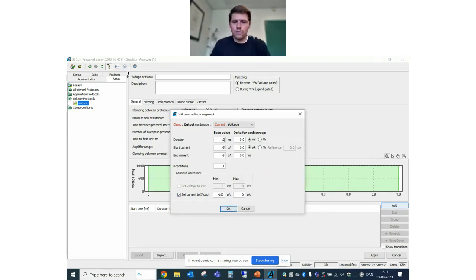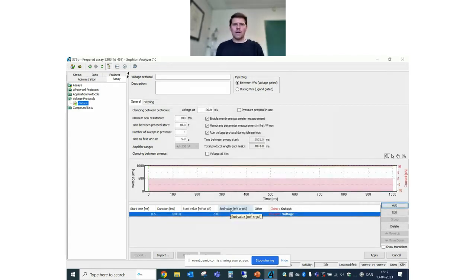And of course, you also need to give it a duration. There we go. And then you see this purple interval here is the adaptiveness, and the dotted line indicates that there is a fallback value, but the actual value is not known until after the experiment. But it's within this range.